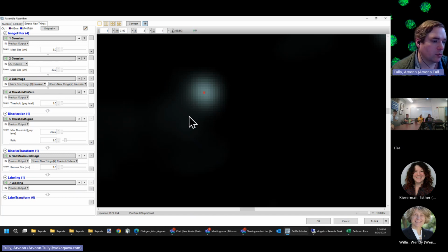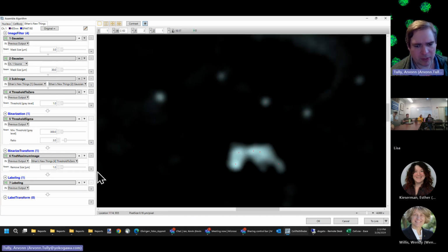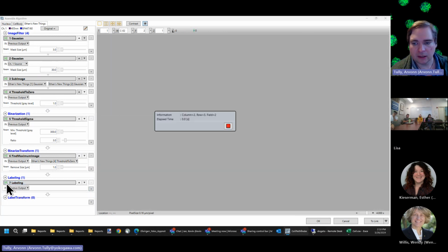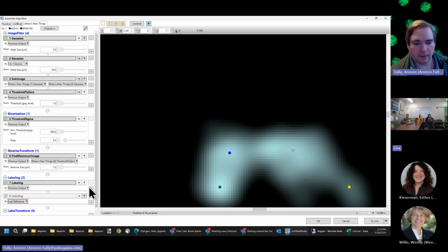a seed point. We can do a seeded watershed here if we want. There's a couple ways we can do this. I'm just showing you how in-depth you can go here. This allows us to separate out structures like this. In order to do that, typically you do a labeling here, so each of those are separately identified. And we're going to need to do an extra labeling.